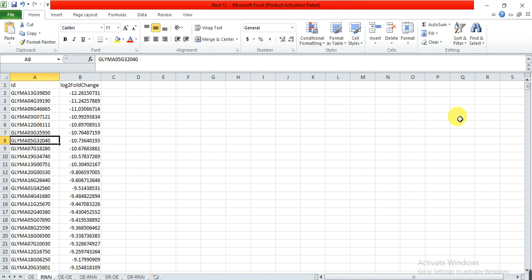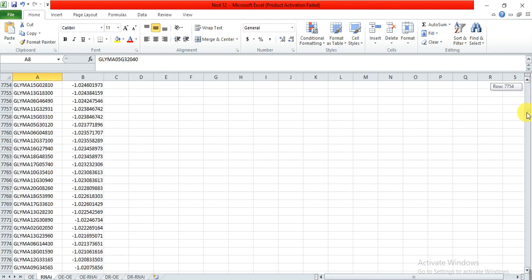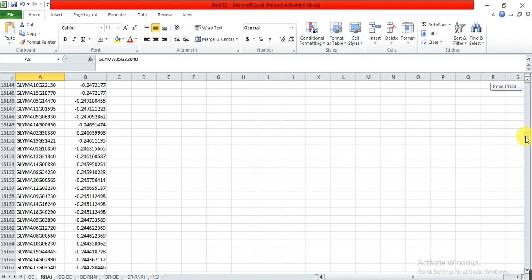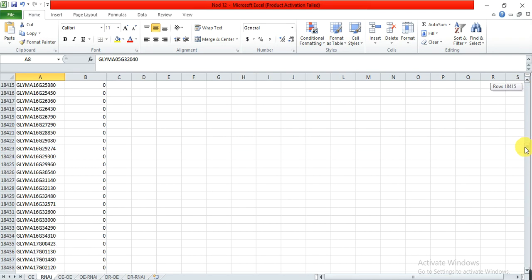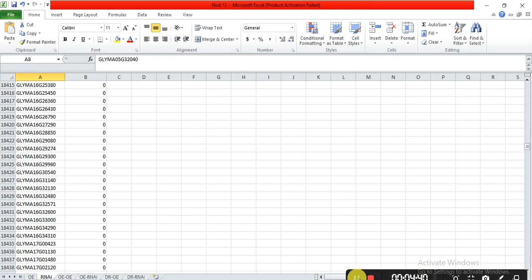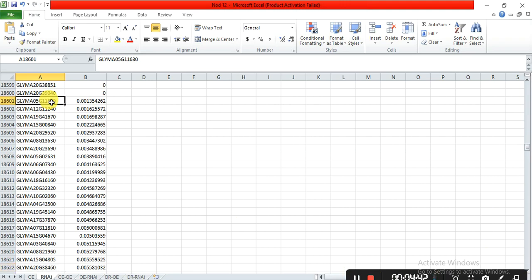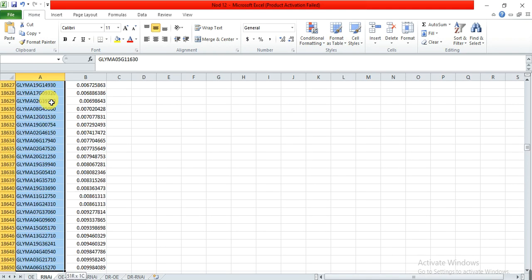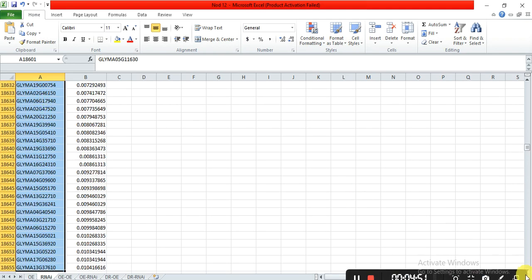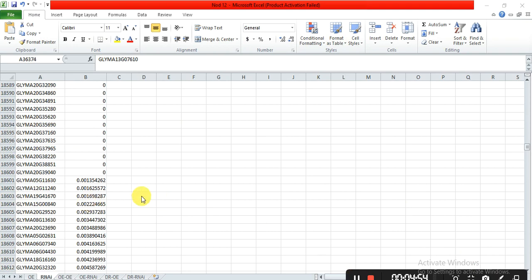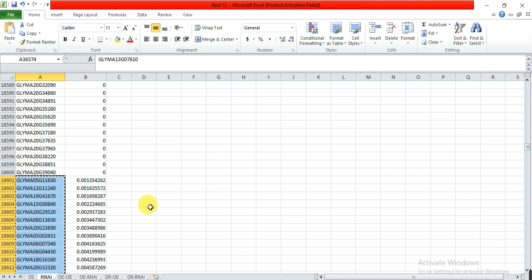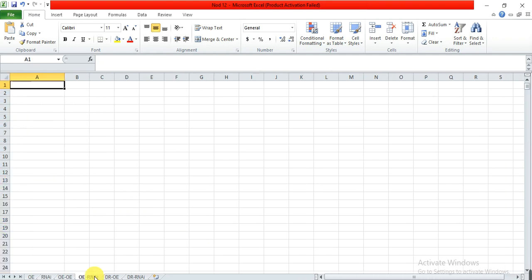Now for the RNAi line data, we also find the upregulated genes using positive log2 fold change values. We select all those genes, shift-select and scroll down, then copy the selected upregulated genes in the RNAi line and paste them into a sheet labeled 'upregulated in RNAi lines.'